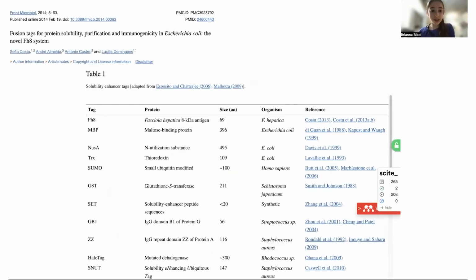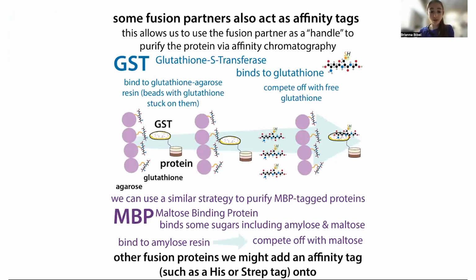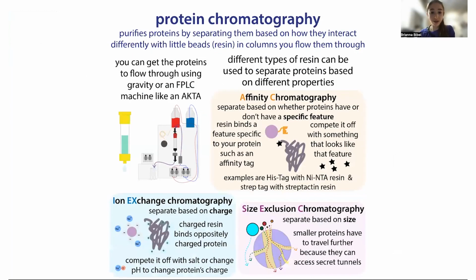So let's look at a couple of these other ones. I like SUMO for a variety of reasons, but one of the things about SUMO that isn't good is that it can't act alone as an affinity tag, whereas some of the fusion partners can act as an affinity tag as well as a solubility helper. A couple of these examples are GST and MBP. When we're talking about affinity tags, I'm talking about something that we could use for affinity chromatography. So much more on chromatography in other posts, but basically we have these columns that are filled with these little beads called resin.